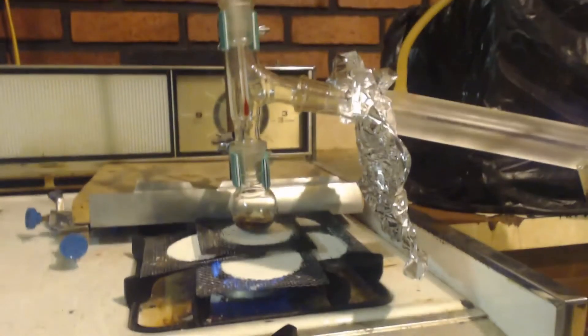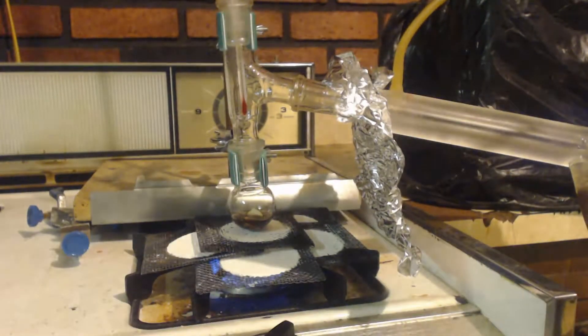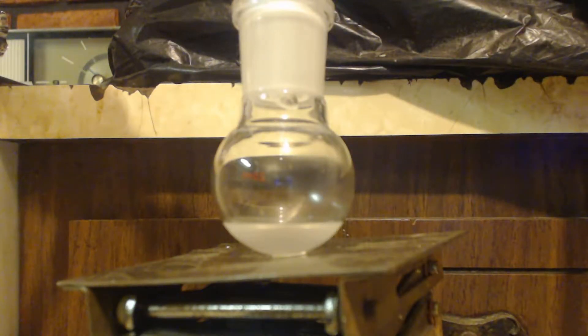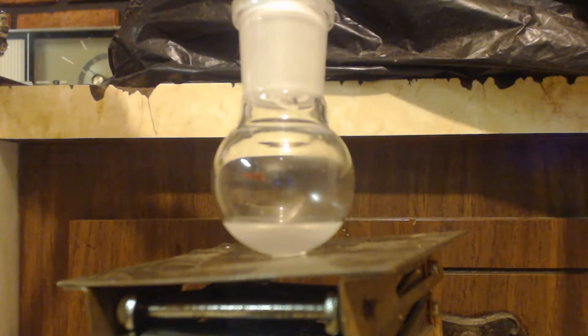The benzene is probably out of there by now. So we'll just distill from 105 on up as much as we can. That's the end of the distillation — that's a 25 milliliter flask, so I'm guessing that's probably like 3 milliliters. Terrible. We're going to have to put some magnesium sulfate in there and dry that up. You can see how milky it is. I got some Epsom salt that's been baked out. I'll throw that in and shake it around — should clear it up.